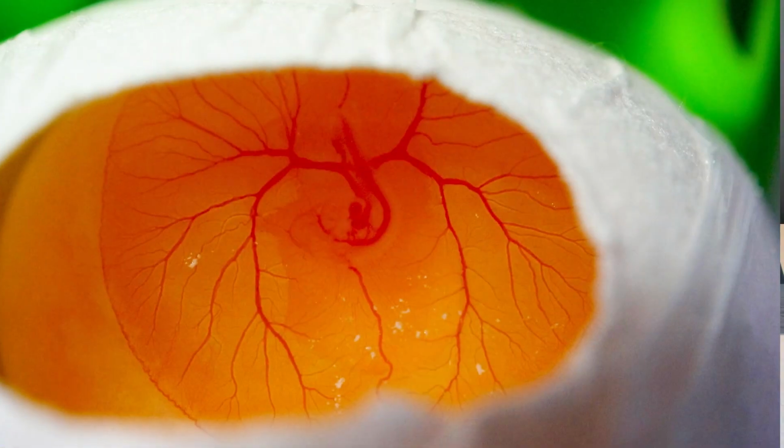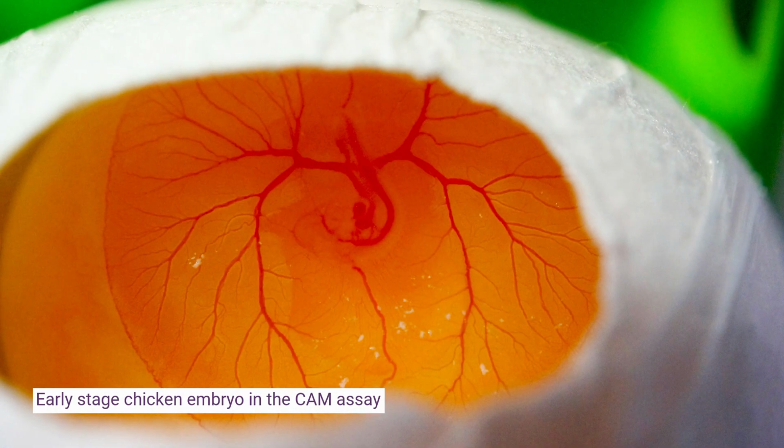Our second topic where we mainly use the CAM assay is biomaterial research. So we test different biomaterials for their biocompatibility and, depending on the application, their pro or anti-angiogenetic effects. In both those topics, we have quite a focus on the microvasculature. So we check whether small vessels grow towards the biomaterial or towards the tumor cells.